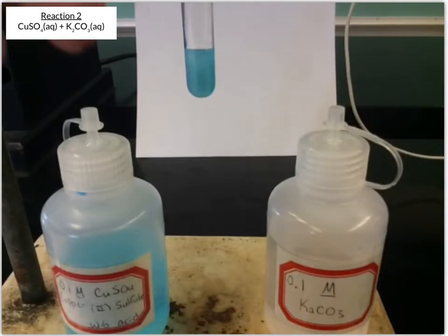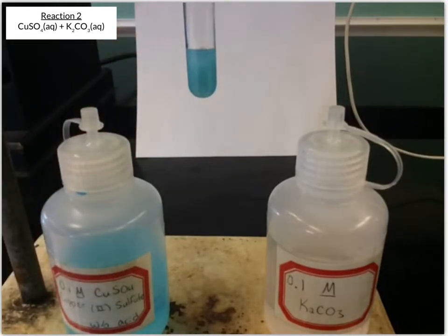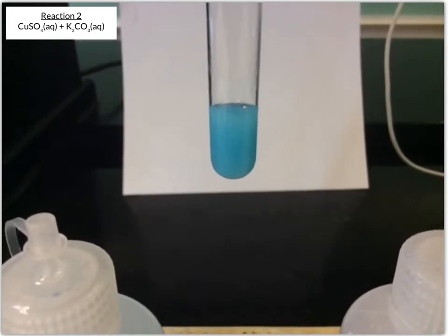And you can see it's still blue. It's maybe a little bit different shade than it started, but it doesn't look clear anymore. You can't see through it. But let's do a little bit of stirring. And so it didn't really change with the stirring, but it still just looks like this solid blue type solution. You can't see through it.